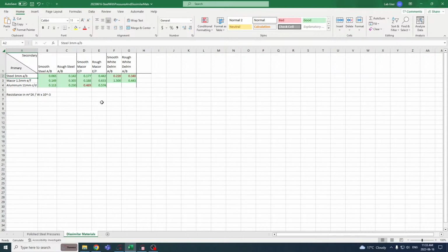What I encourage you to do, if you're interested in measurement of contact resistance between two objects, or measurement of the effective value of a material introduced between two similar or dissimilar materials, and you want to see the effects of that application, is get in touch with us, and we'll really talk about what your two materials are, whether they're one-dimensional shapes or other shapes, we can usually deal with them, and what the pressures are, what the operating or application temperatures are, to really understand that and make those measurements.